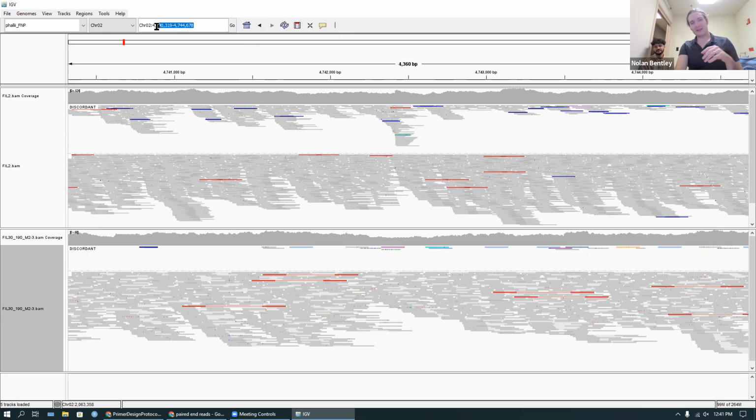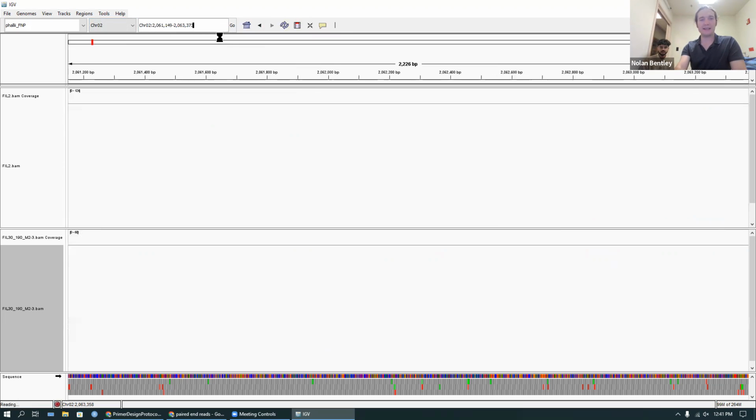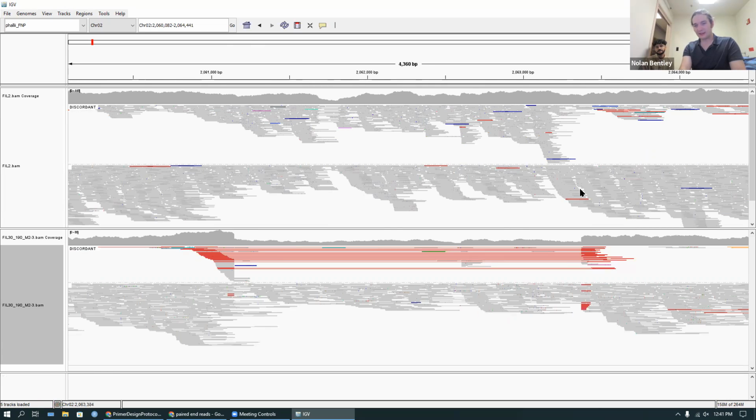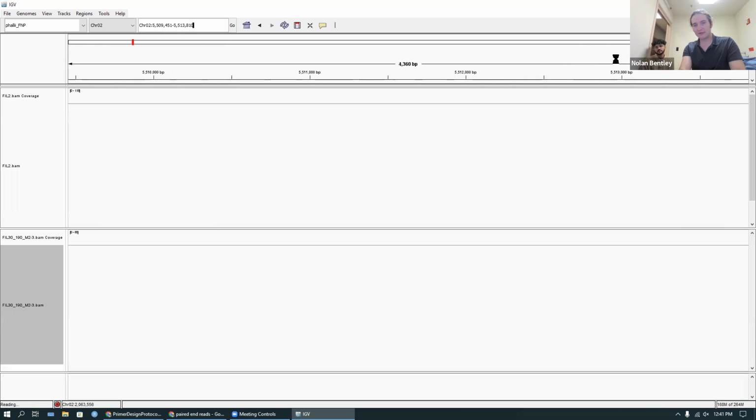But that's the idea, that you can zoom in, see where the actual mutation occurred, and validate everything. Now, actually viewing the genome at this location and getting gene information. All right, well, I'm going to stop doing this in front of everybody. Getting the gene information can be really useful.